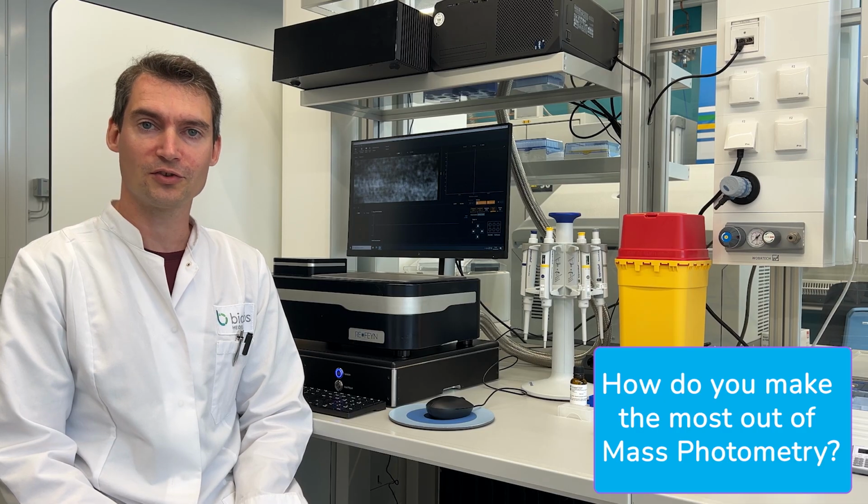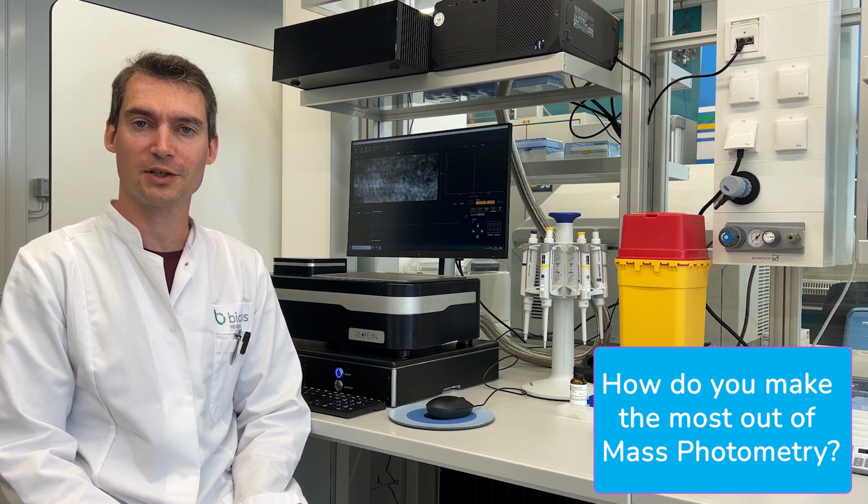Mass photometry for us is a very valuable method to analyze the sample as soon as it comes in. So basically we can do an initial check of the quality of the sample.